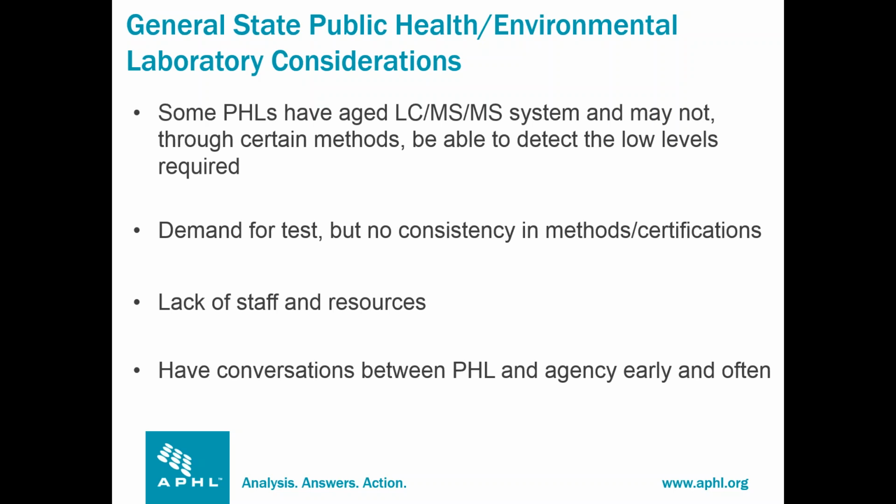So that was just a quick snapshot of 3 labs that are kind of leading the field with PFAS testing. New York is another state that is doing quite well, and you'll hear a little bit about the method validation study that those labs are involved with EPA from Chris. So that's what I have.